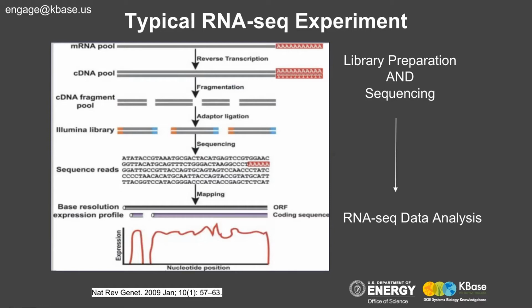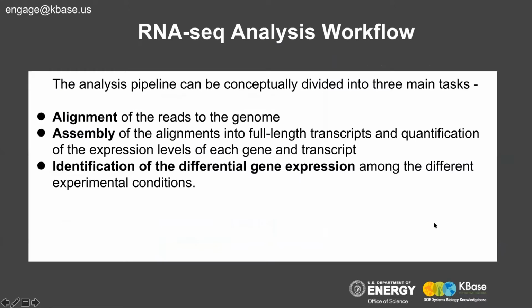And these experiments generate very large complex data sets that demand very fast, accurate, and flexible software to reduce the raw read data to comprehensible results. So in this webinar we are going to talk about RNA-Seq data analysis. Once sequence reads have been obtained, these reads must be analyzed with accurate, efficient software that is carefully designed to handle this type of data.